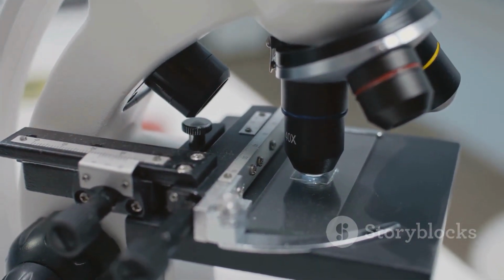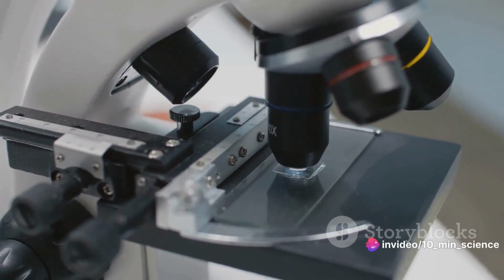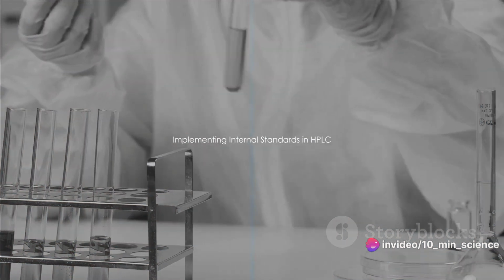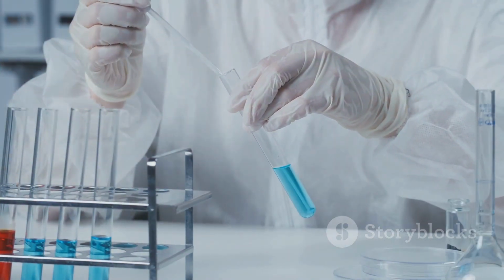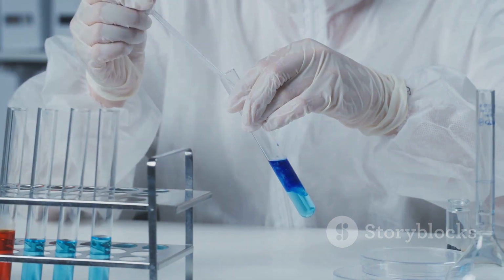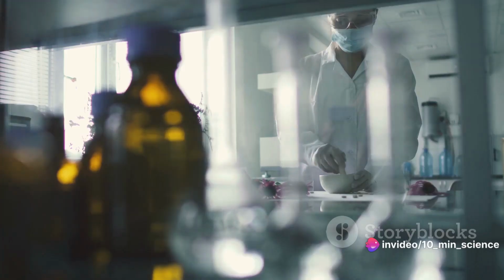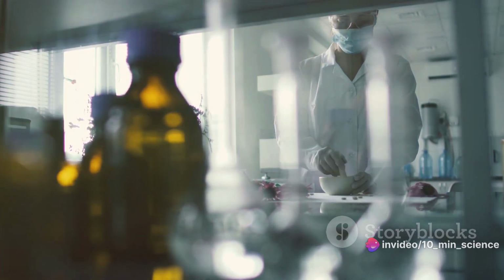So through their consistent behavior, internal standards allow us to correct potential errors and achieve more reliable results. Now that we understand their role, how do we actually implement internal standards in HPLC? Well, the process of adding an internal standard to a sample in high-performance liquid chromatography, or HPLC, is a crucial one and involves a series of methodical steps.